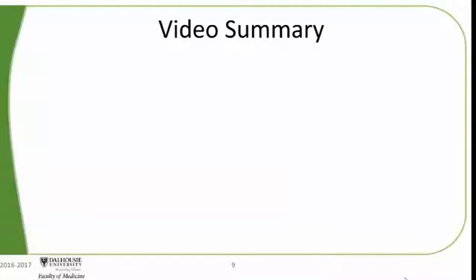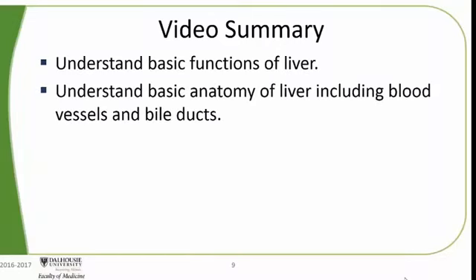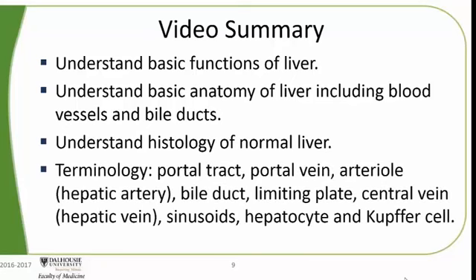Okay, after reviewing this video, you should understand the basic functions of the liver. You should also understand basic anatomy of the liver, including blood vessels and bile ducts. You should understand histology of the normal liver, and you should understand the following terminology: portal tract, portal vein, arteriole, bile duct, limiting plate, central vein, sinusoids, hepatocyte, and Kupffer cell.